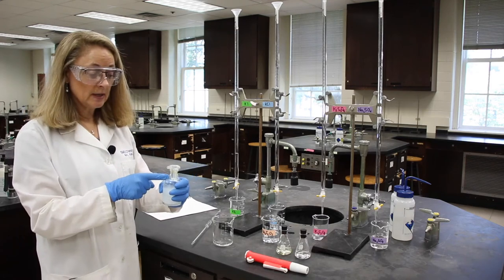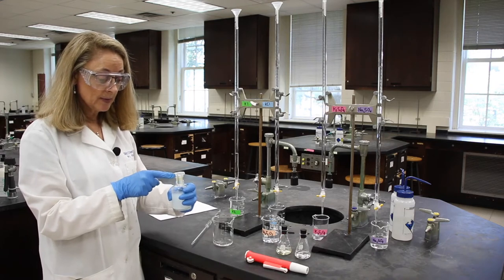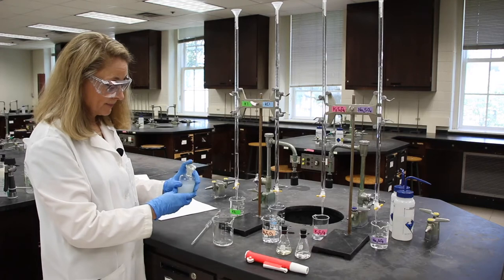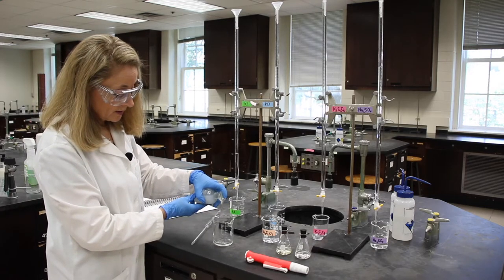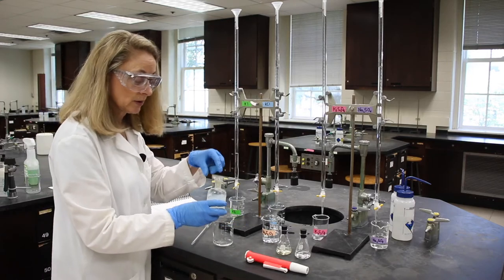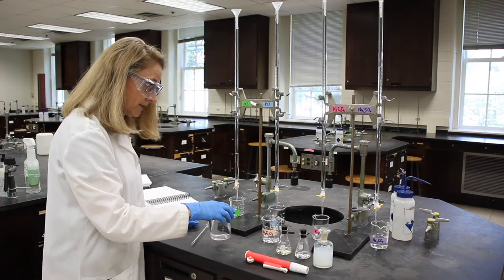This is kind of a neat bottle. There's a protrusion in the neck. If you line that up with the protrusion in the cap, and put your finger over the top, you can dispense drops of liquid without having to take off the cap. So I've done that.